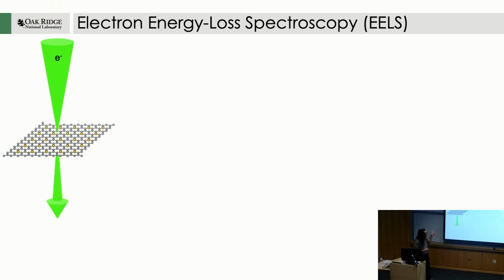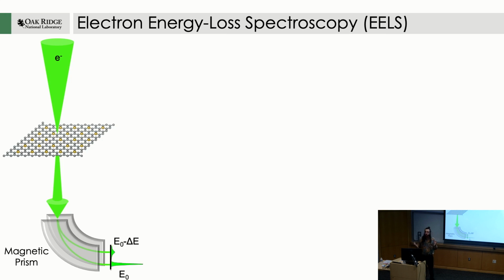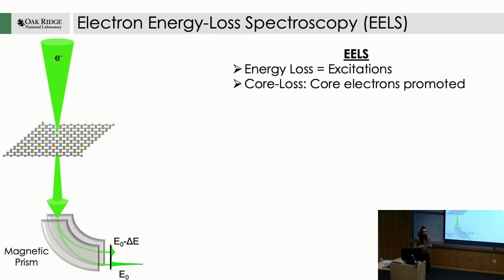In this, we take the transmitted beam and we put it through a magnetic prism. What this will do is it'll disperse the electrons by how much energy they had or how much energy they lost going through the sample. This will be projected onto a detector, and individual peaks will correspond to energy excitations in a sample, where they gain that energy in the sample by losing electrons or losing energy from the electron beam. And so there's a whole lot of different things you can do with this.